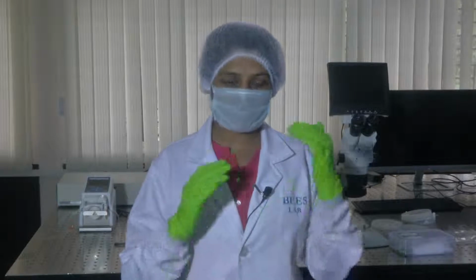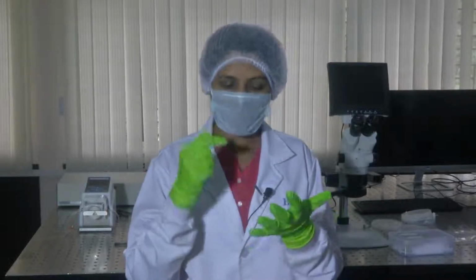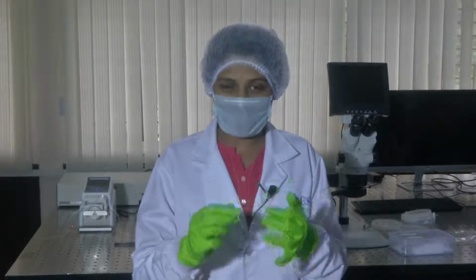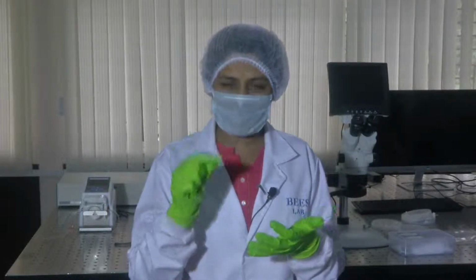Microfluidic flow control is one of the critical technologies which has been widely used because of the need for precise control of fluids through these microchannels, which are very low in quantity. The liquid sample you take to flow through the channels is very minimal.